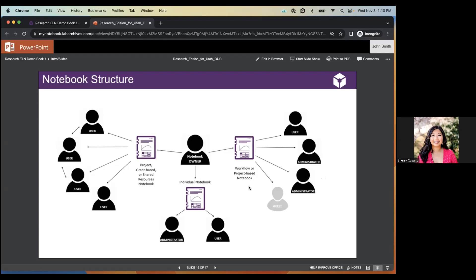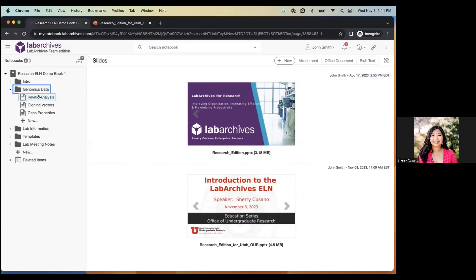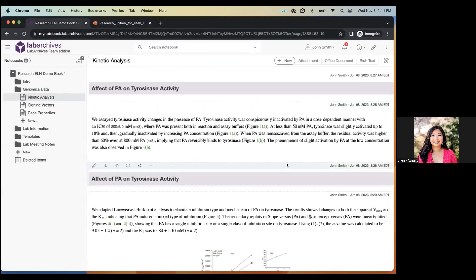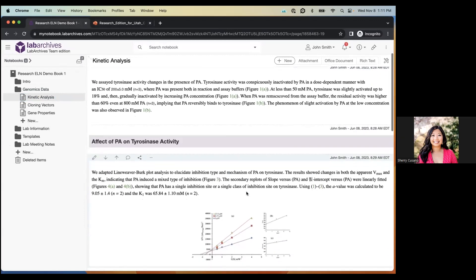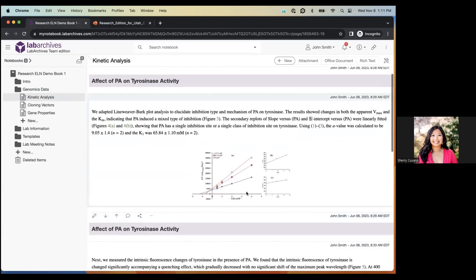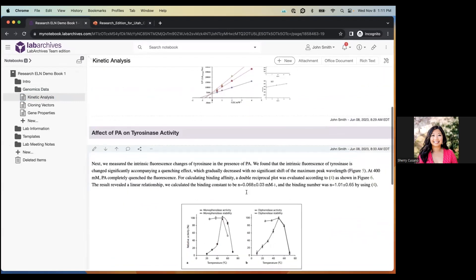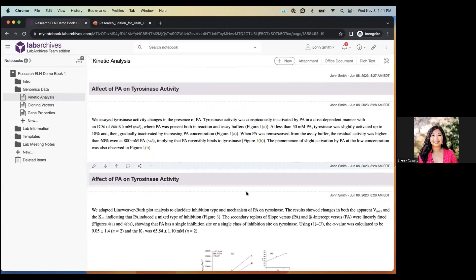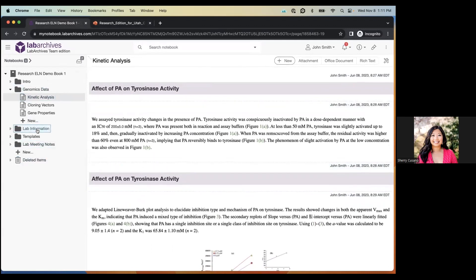In undergraduate research we've seen labs use both of these approaches successfully. A hybrid approach — combining project-based and individual-based notebooks — is also common. Now I'll show you the live demo. Here is a notebook I pre-created. The center of the screen is the page, which is your workspace where you can add text, images, file attachments, and all types of data.